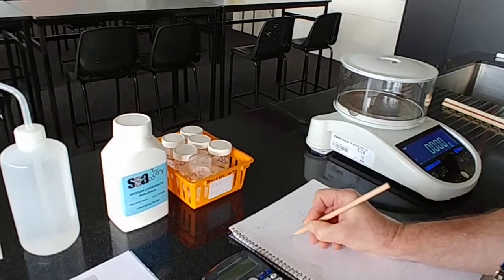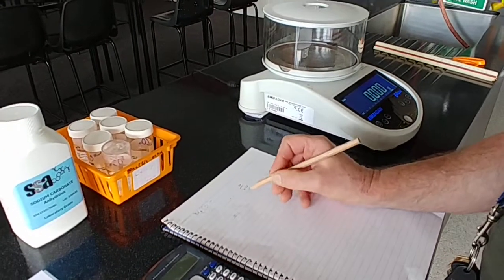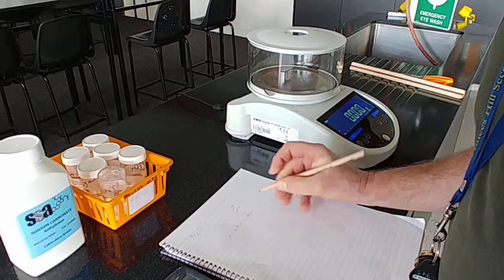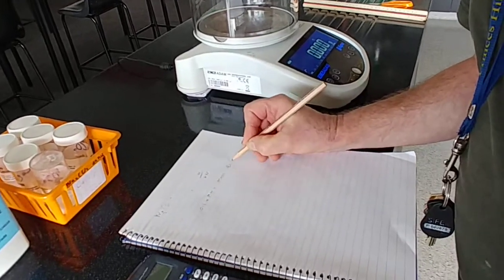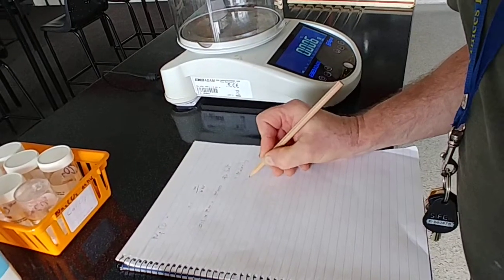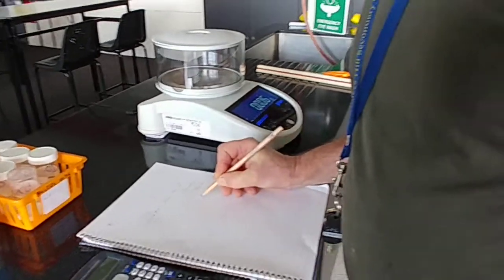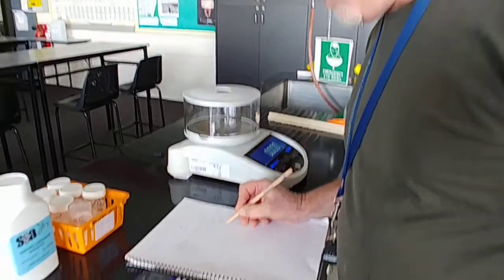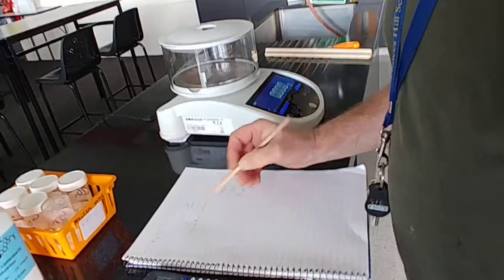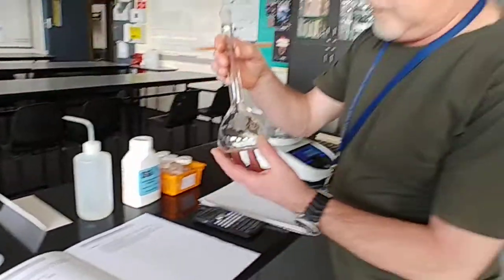So we want 0.1 mole of substance multiplied by the molecular weight gives us the mass that we need, and then we put that into solution, and it becomes molarity. We're going to do it at 250 mL, which means that we divide by a factor of 4, because normally molarity is worked out per litre, so we're going to do it in 250 mL, because we're going to use a 250 mL volumetric flask.